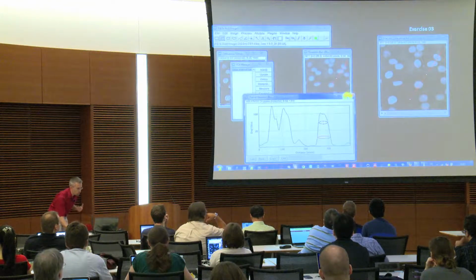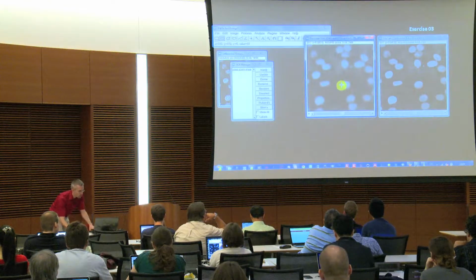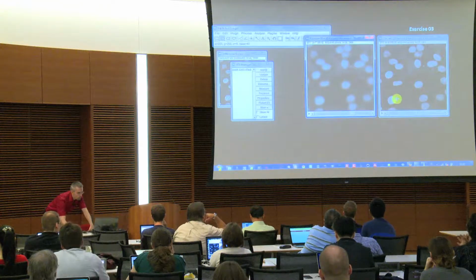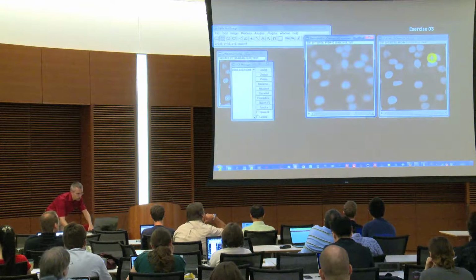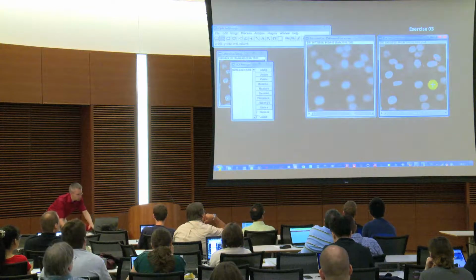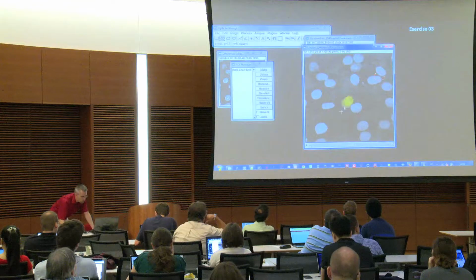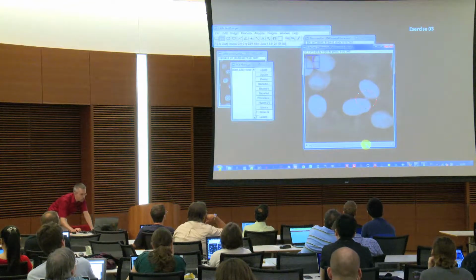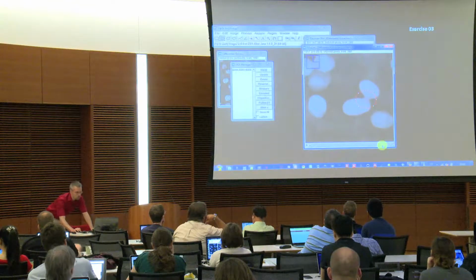And that is also why the filter check should help you in these comparisons to basically see, okay, I'm going up to a point where I eliminate those bright spots if I don't want to have them anymore. But then I also should stop because you also see a second problem at some point which comes up if you look at this encircled area here. Because if I now go higher with my filter radius, then you see at some point it also connects the features. And that is obviously often counterproductive.